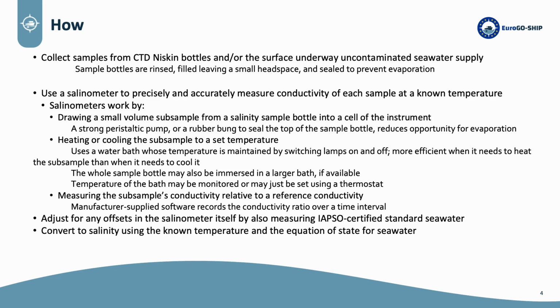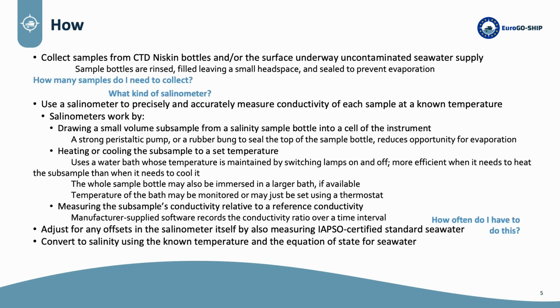So this is the outline, but you may have a few questions about the details, maybe starting with, well, how many samples do I need to collect? What kind of salinometer do I need to use? Does it matter? And how often do I have to do this adjustment by measuring standard seawater process?